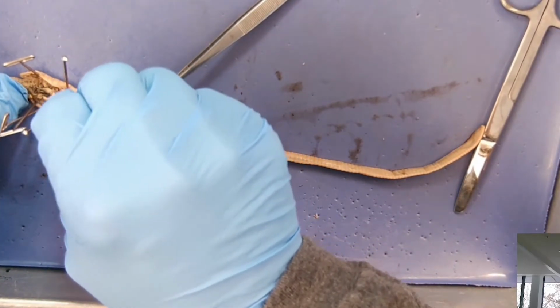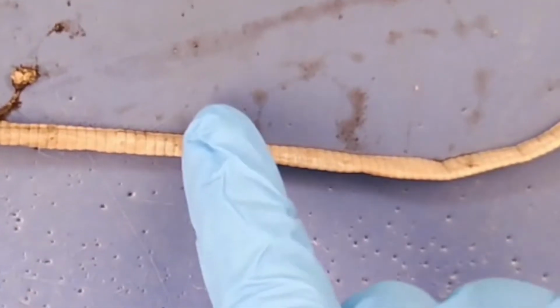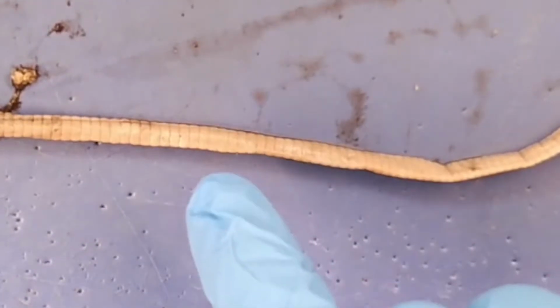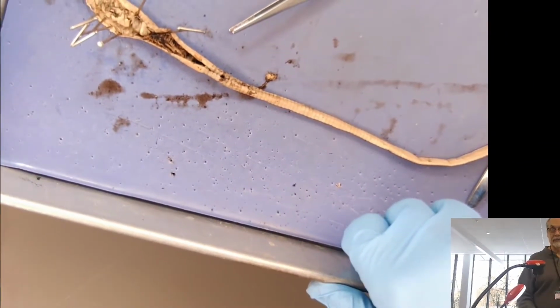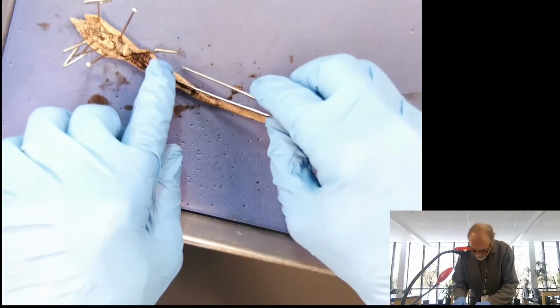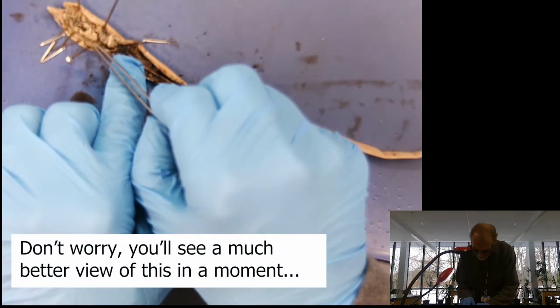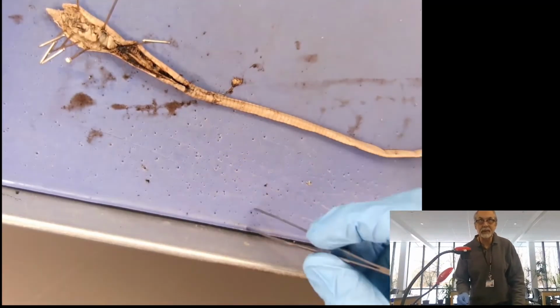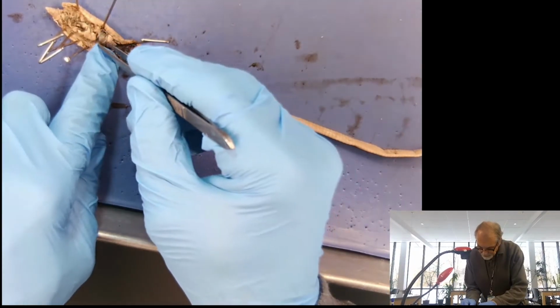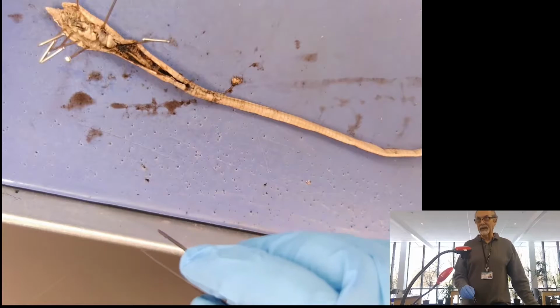Let's see if I can zoom in some more. Now, one thing I'm going to note, if you look on the outside, you can actually see the individual segments. And an earthworm has something on the order of over 100 segments. And each of those segments, and you might be able to see it here, if we kind of pull this apart a little bit, you can see what look like little lines here, and those lines are called septa. Hopefully you can see it on the screen. Inside here, these little lines represent the septa, or the barriers around each segment.